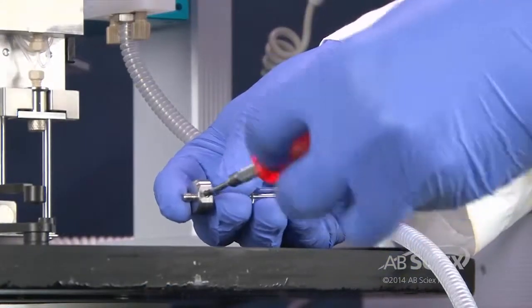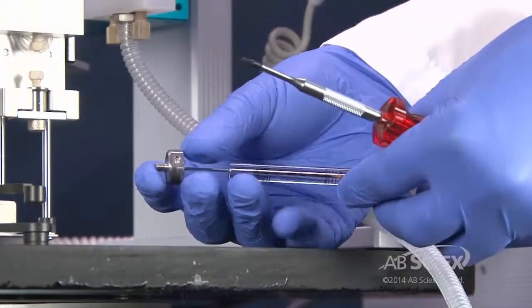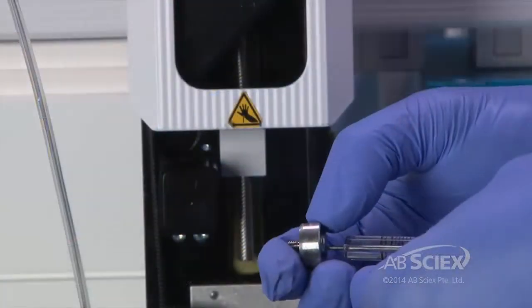Using a T6 Torx driver, remove the plunger holder from the removed syringe and refit onto the new syringe.